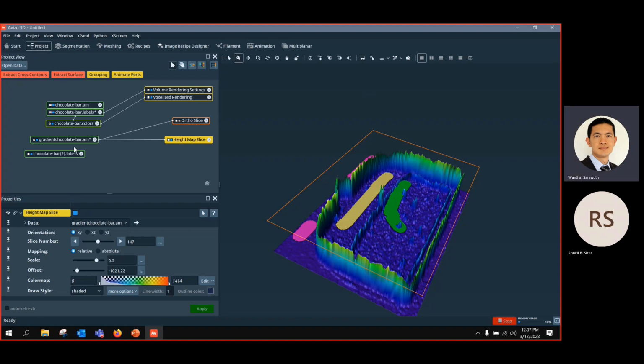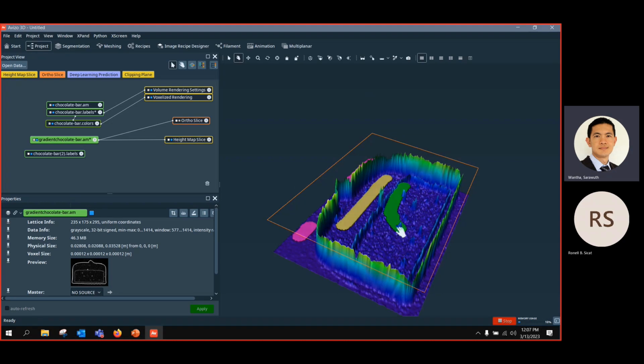What I did here is just the grayscale image, and what we see here, we just visualize it. To take it out, it's the only information you have here. It's just only intensity.